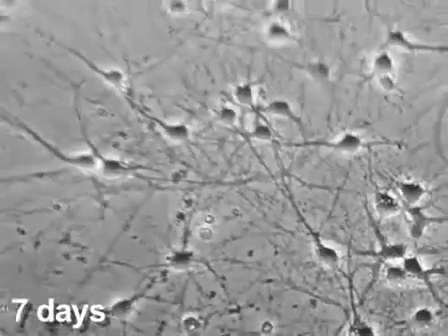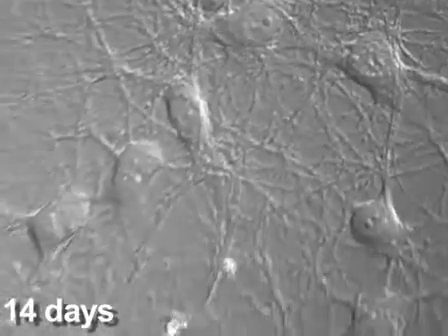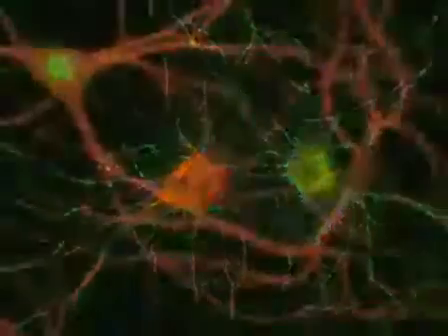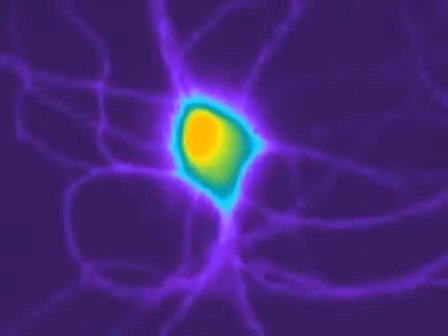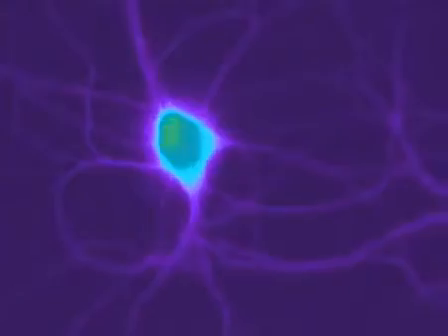These are postnatal day mice that we prepare those neurons from. We typically use those cultures for either electrophysiology, for protein or RNA preparations. We use the same culture preparation for calcium imaging or sodium imaging.